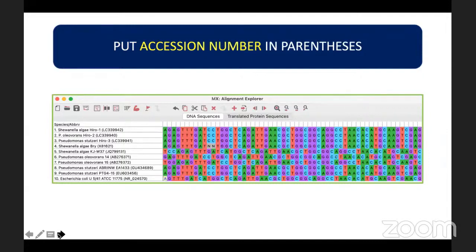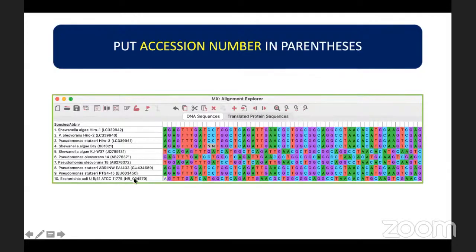Repeat the process: click on Web, Query GenBank, paste the accession number, and then add to alignment. After adding all the sequences for analysis, you can edit the labels of your samples. I highly suggest that you put the accession numbers in parentheses, as these labels will be reflected as-is in the cladogram after phylogenetic analysis.